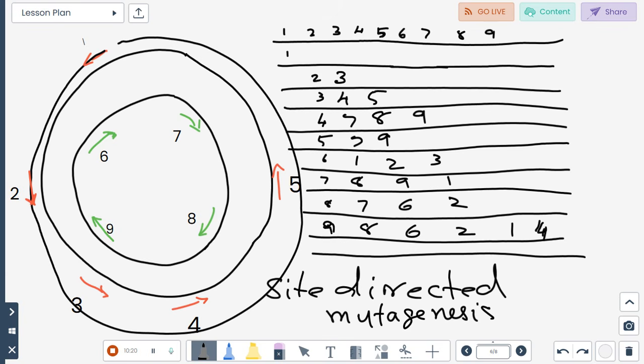So you will be having heterogeneous PCR products where you have one site modified or two sites modified or three or four or five sites modified, or 6, 7, 8 or 9 sites modified. So you will be having all the combinations. These products you can ligate with a cloning vector, screen, and each plasmid, if you sequence it, you will get all these different types of mutations.